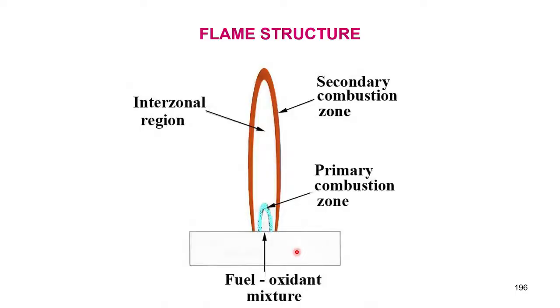If you remember this, what I am going to show you will exactly look the same, there is no difference, but here this is the flame burner in atomic absorption. It is a rectangular block through which the air, fuel and sample is coming, and I am showing you a front view.